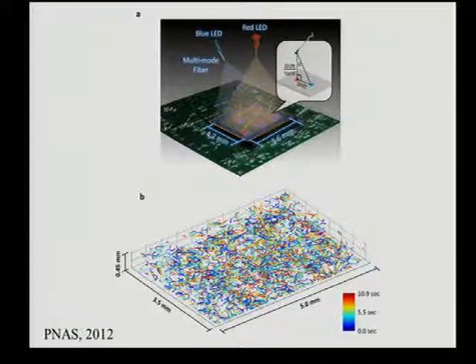but not just a few of these sperm, thousands of them in this entire volume. A traditional light microscope has a mismatch in terms of observation volume, and a microswimmer or a sperm would quickly pass by the focus point of an objective lens. And this is where this kind of platform is quite unique.